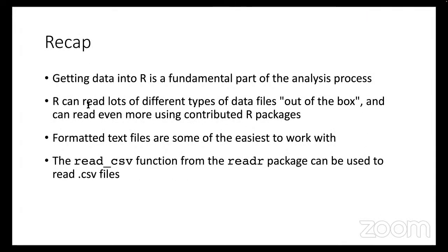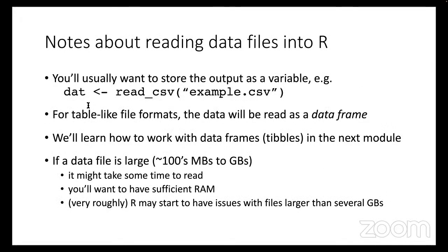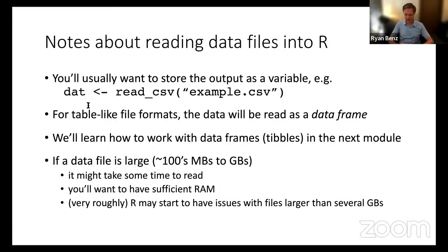Ryan, in terms of reading the data, here we are reading a CSV file. There was a question about reading a .raw file. How can we read those types of files in R? Great question. I think we're talking about maybe a .raw file from a mass spec vendor format.